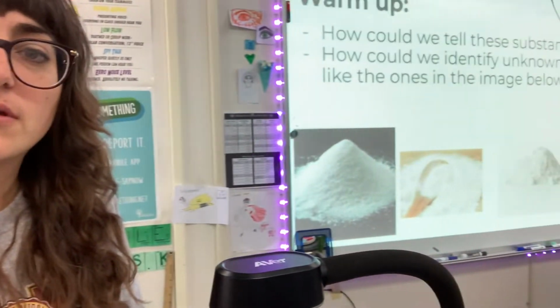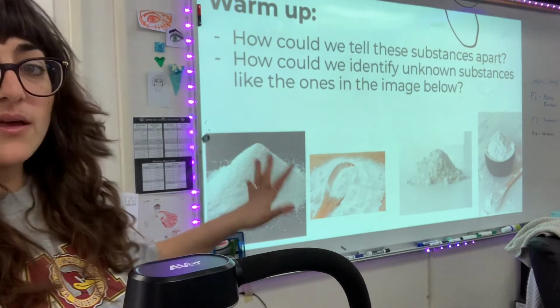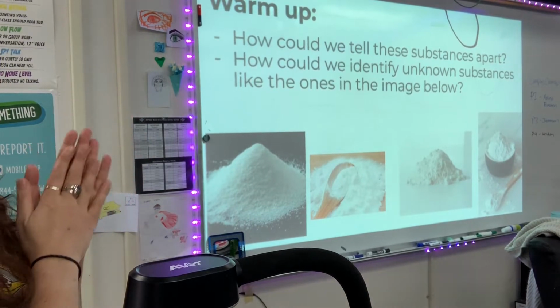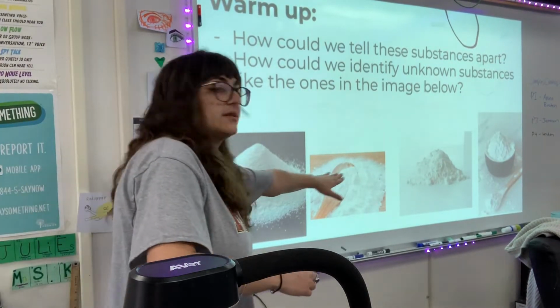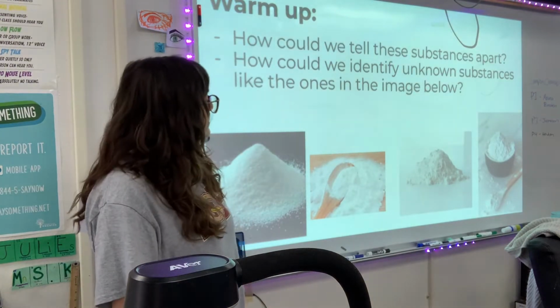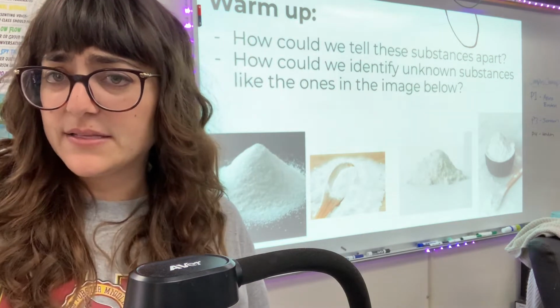So, we started out by talking about these questions. How could we tell these substances apart? We have four solids here, all in powder form, all white. And how could we identify unknown substances like the ones in the image below? I want you to think about that.